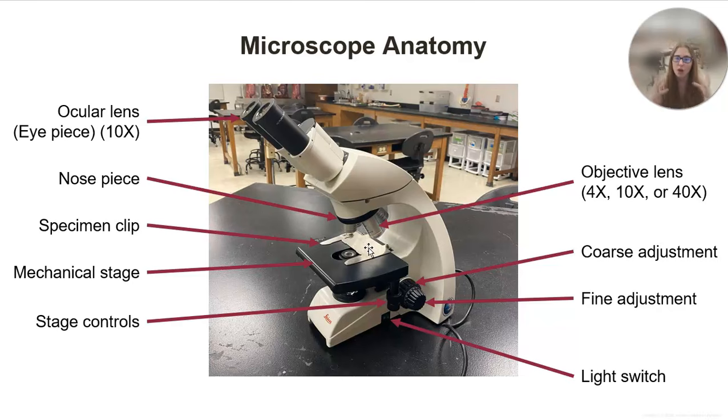And in doing so, on the mechanical stage, we have the ability to move in 3 different planes of motion. We have up, down with the mechanical stage itself, which is kind of like our Y axis. We have our X axis, which is left to right. And then we have our Z axis, which is forward and backward.